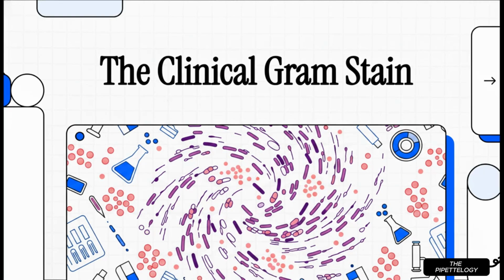All right, let's dive into one of the most fundamental procedures in all of clinical microbiology. I'm talking about something that's fast, super powerful, and gets done every single day in labs all over the world to help guide life-saving decisions. Yep, this is your masterclass on the clinical gram stain.